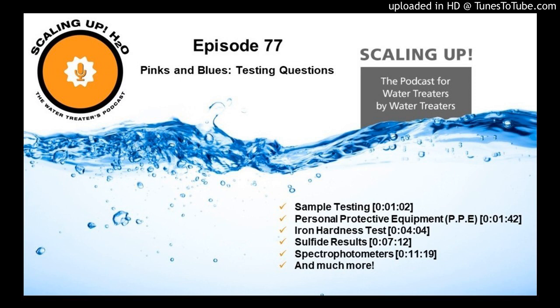That's the cool thing about our test. And I get so many questions. Can I do this? What happens if I put this with that? Well, folks, try it. If you do one exactly the way it's supposed to be done, and especially if you have a sample where you know what it's supposed to be testing as, and then you run your different ways of running the test, you'll be able to find out very quickly whether your hypothesis of making that change will work or not. So I hope that helps, and I want to thank all those people for asking those questions to me.